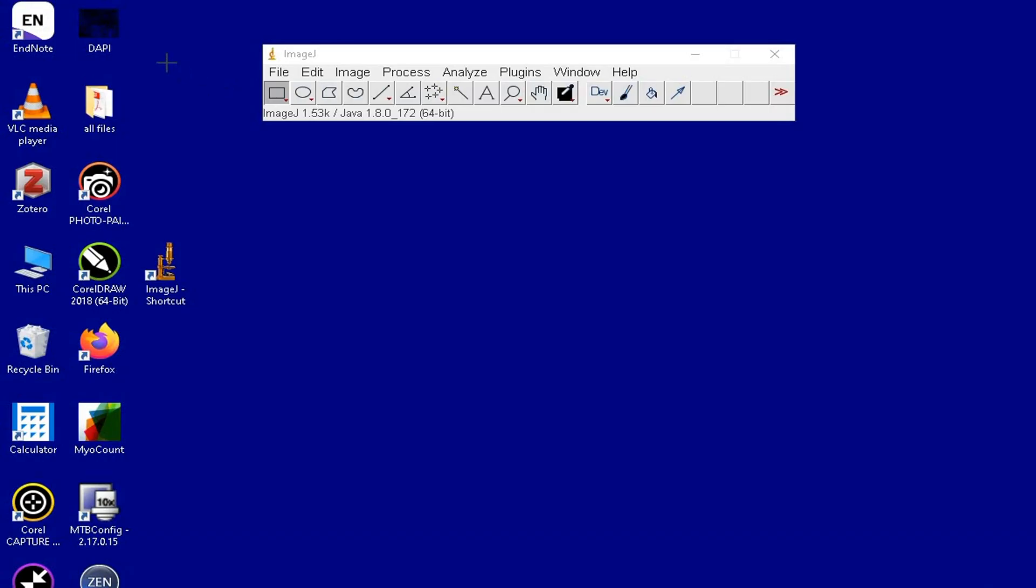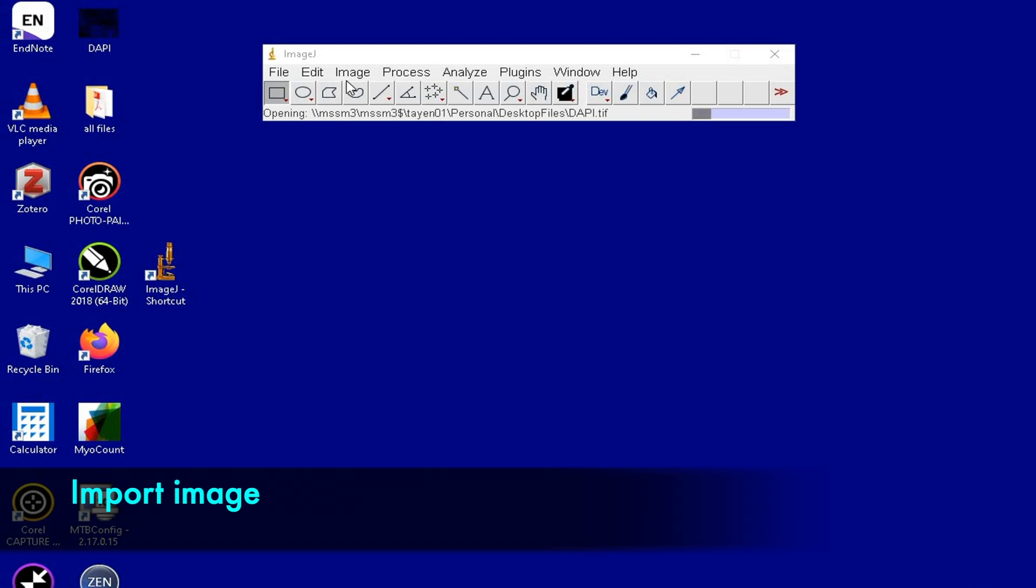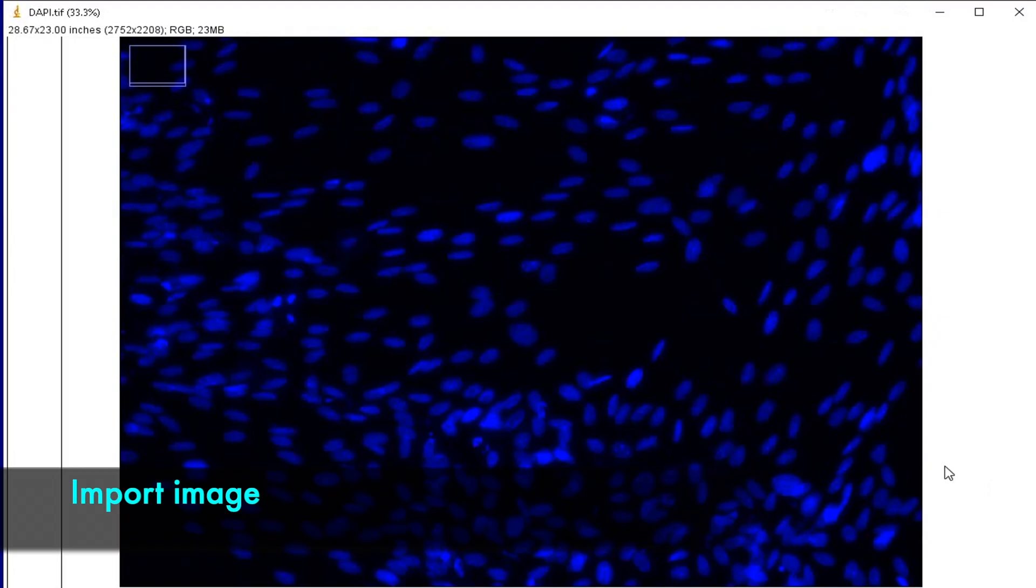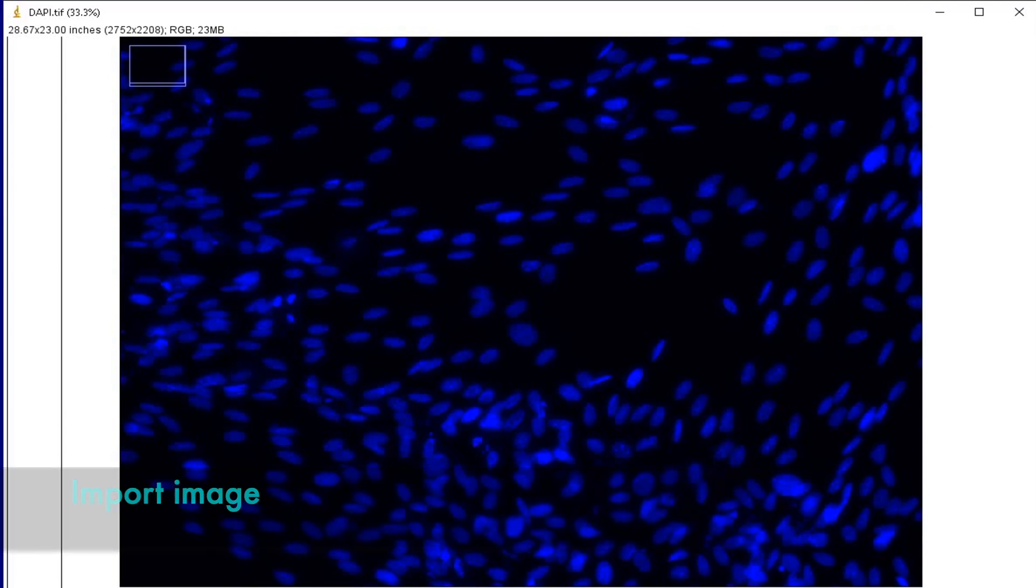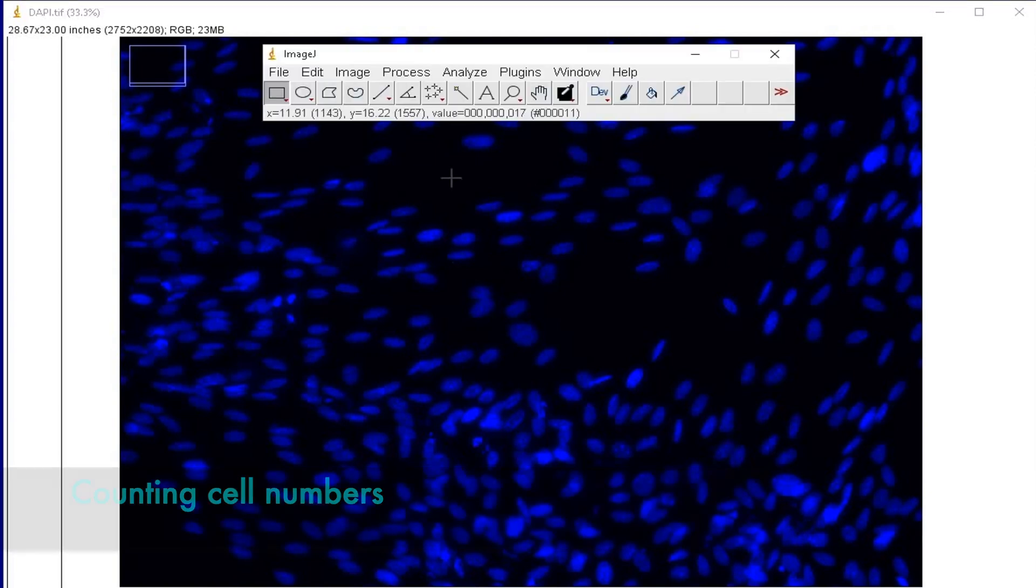To count the cell numbers, first let us import an image. This image is of cells stained with DAPI. In the first part of the tutorial, we will learn how to count the number of DAPI stained cells.